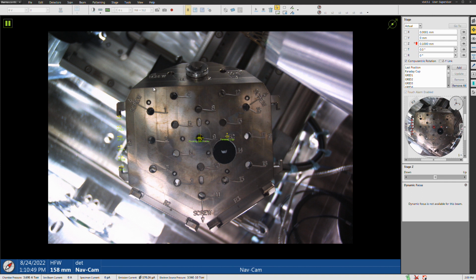So polycrystalline nickel, and this has been mounted using well-dried carbon paint on a standard half-inch diameter pin stub. Okay, now this facet here of the multi-purpose holder. Your stage may or may not have one of these multi-purpose holders. I love these things. These are great. They can take a ton of these stubs in here, plus grid holders, right?